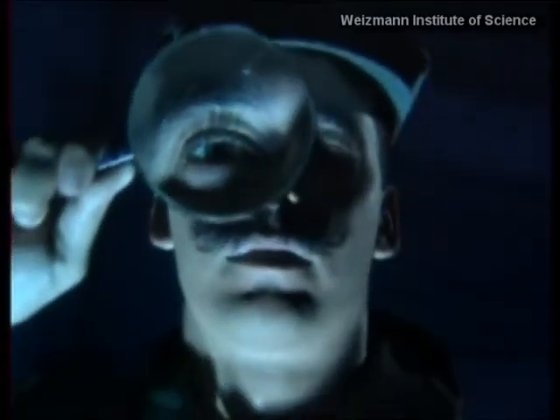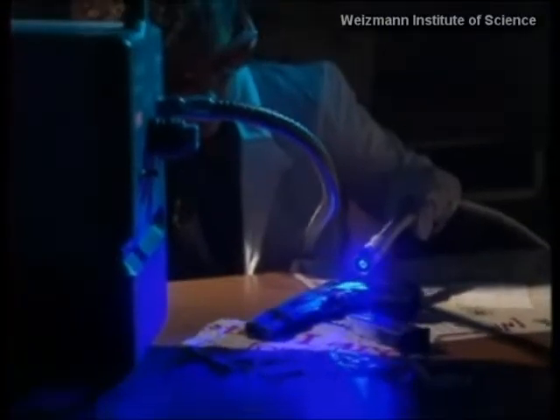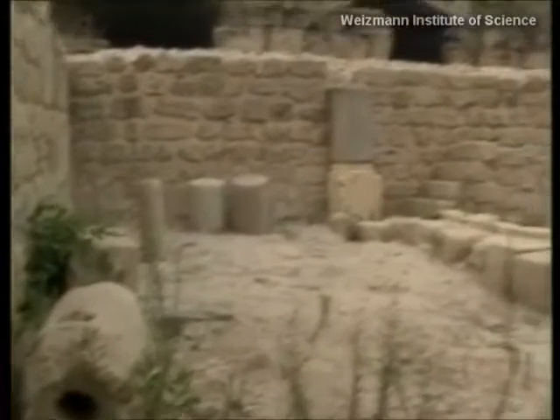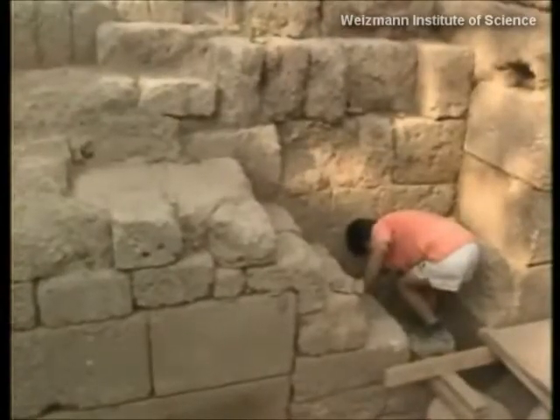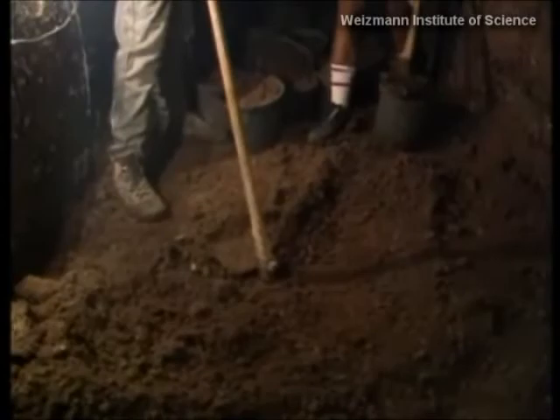Things have changed since the days of Sherlock Holmes. To speed up the pursuit of criminals, modern detectives have the benefit of on-the-spot, real-time forensic tools, such as this optical device, which quickly scans and identifies fingerprints. Digging up the past, like police work, is a painstaking job, but also stands to benefit from the introduction of state-of-the-art technology.